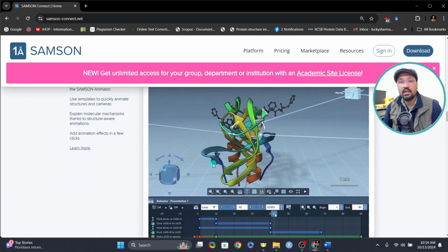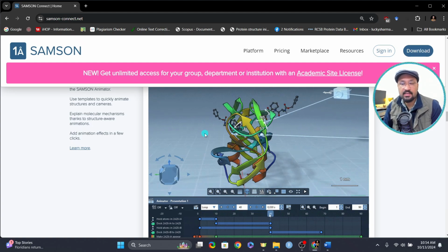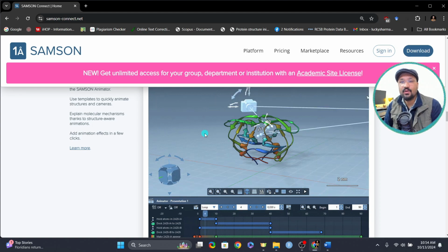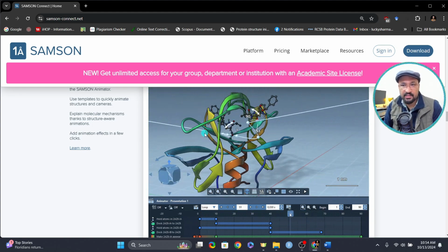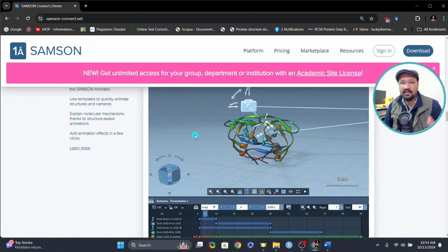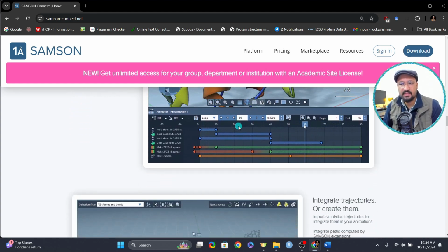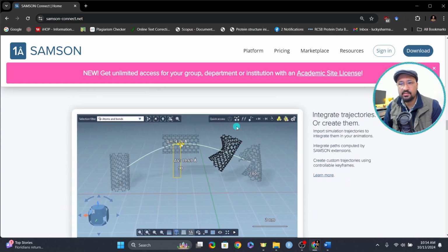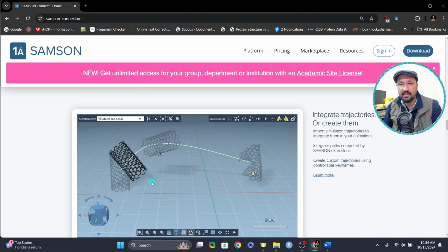Here you can create awesome videos that you can share during your conferences and presentations, especially when you want to present something. If you have a nice video, that will make a long-lasting impression, and whatever you show is secondary, because you have made that impression by creating an amazing visualization. SAMSON is pretty amazing as far as visualization is concerned. You can integrate trajectories and create them. As you can see, how it's been built from one trajectory to another.